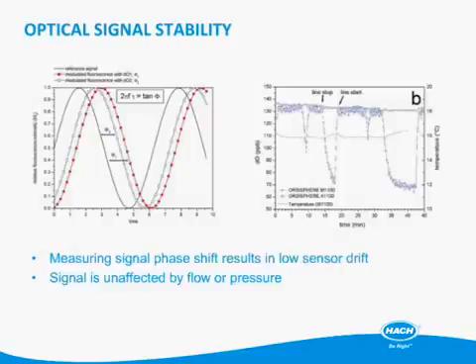What's going on in this slide is that we're diving a little deeper into the optical sensor. With the optical sensor, you excite the fluorescent material with a blue light, and then you get a red response back. If you flash a red light onto the optical sensor, you get back a reflection that gives you a good idea of how much drift the sensor has had, so you can predict drift. You can look at the phase shifts between the red light and the blue light responses, and they're inherently much, much more stable than electrochemical probes.